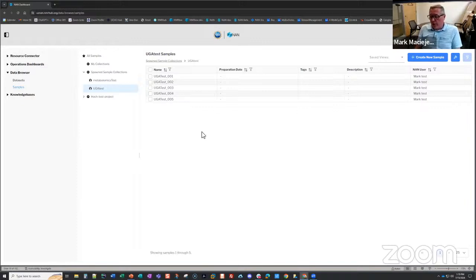Of course, we could have done this as a protein sample or an RNA sample. If you do a protein, then there's an advanced protein window. It's very, very verbose. The amount of information that you can add to the sample is very large. So I think a person could really detail every nuance about their sample in the system we have. But of course, almost everything other than a few fields is optional, so users can choose to do it to the extent that they want.